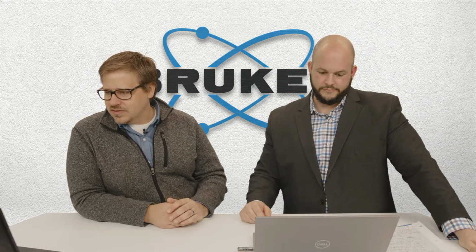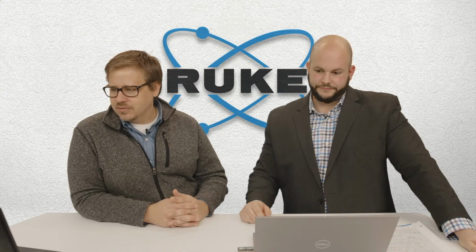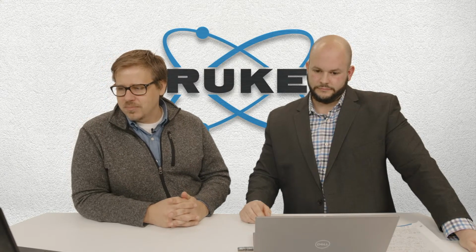Another question from Victoria. How does sample non-uniformity, that is variable thickness or islands, affect the results? Would the modeled results be an average thickness or come up as a different error? That's a great question. You're probably going to be sampling that depending on how big your beam is, so it probably would be an average if you're sampling all of that.